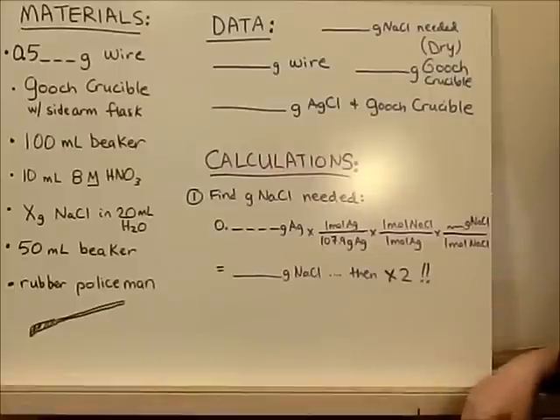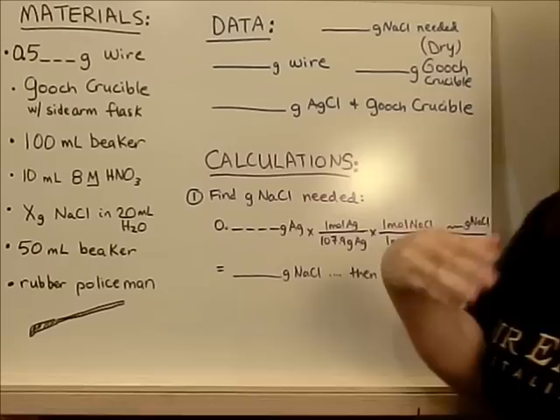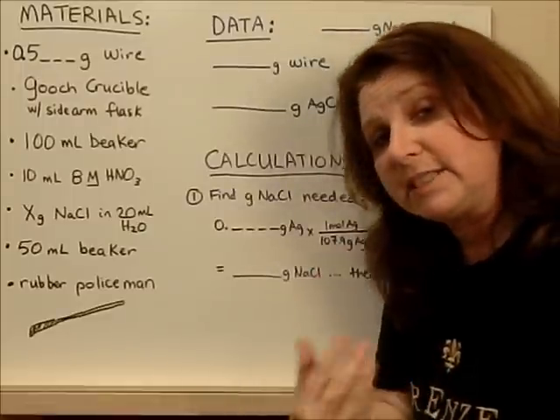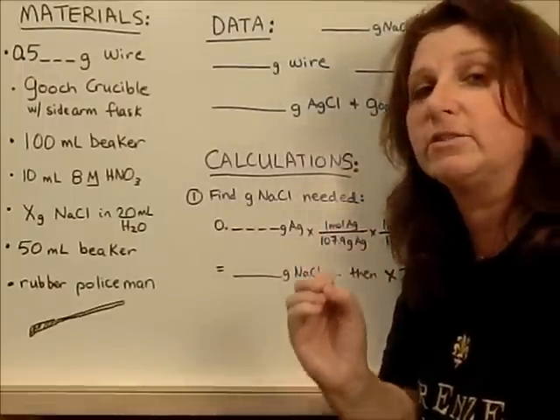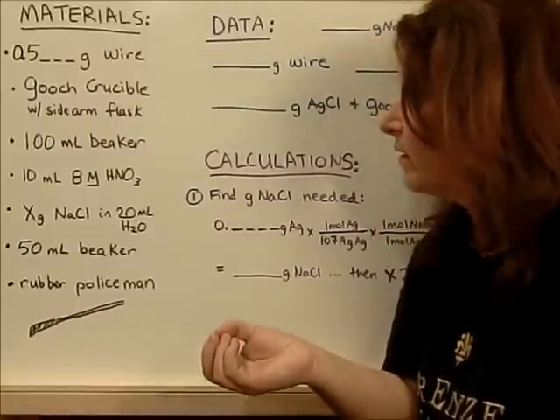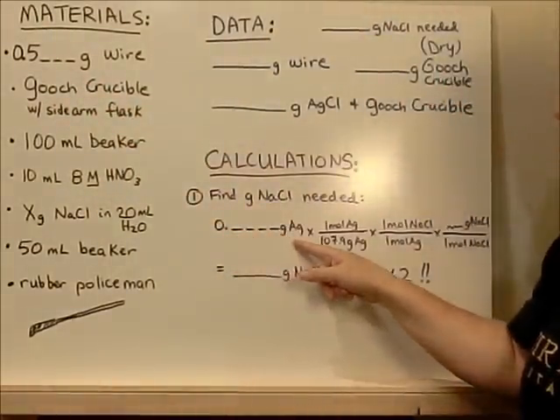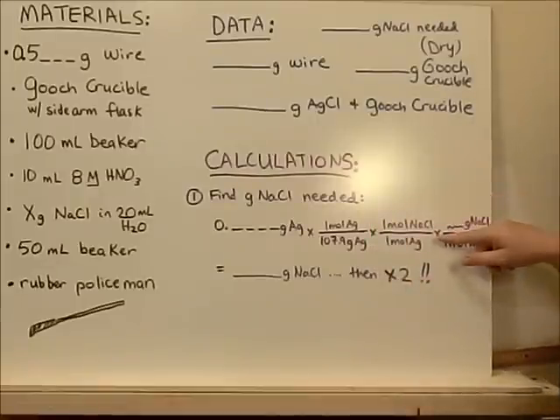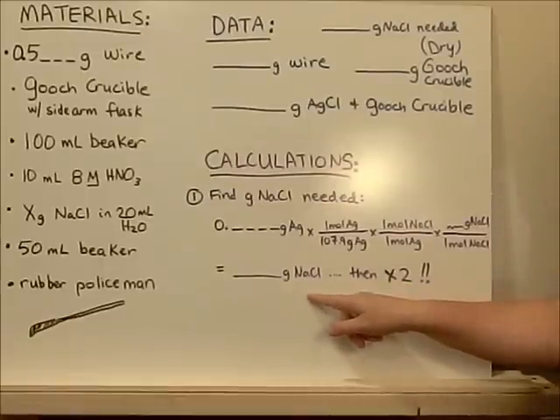All right, now let's talk about calculations, and then I'm going to let you pause in just a moment, okay? So the first calculation you're going to do is, again, find out how much sodium chloride you're going to need. You're going to assume the wire that you weighed out is 100% silver. Of course it's not, but we're assuming that because that way we can make sure to grab every single silver ion there is in the water. So you simply take the grams of the silver wire, assume it's 100% silver, convert to moles, recognizing that Ag and Cl react in a 1-to-1 mole ratio, and then convert that to grams. That will give you the grams of NaCl you need.